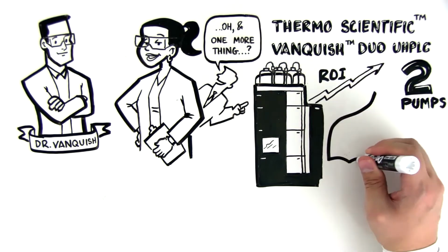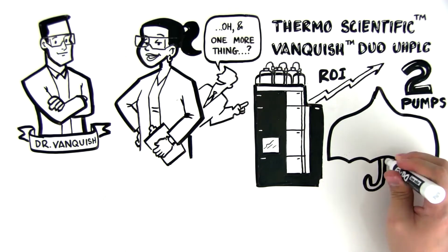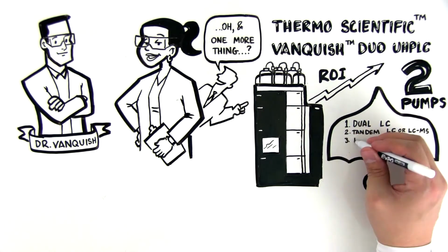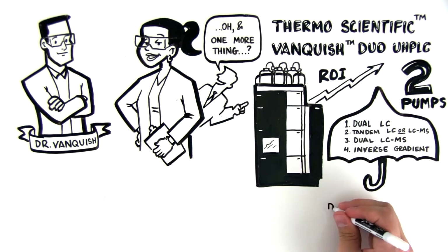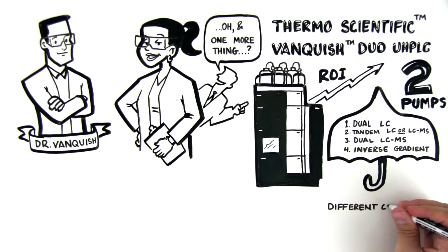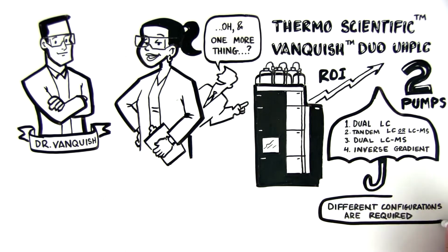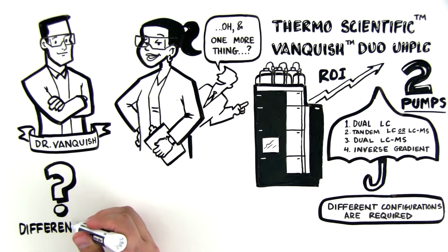There are multiple workflows within Vanquish Duo systems, all with individual names: Dual LC, Tandem LC or LCMS, Dual LCMS, and Inverse Gradient. These 4 workflows each need different hardware configurations, but the one thing they all have in common is that they always have 2 pumps. So what are the differences between the 4 workflows?